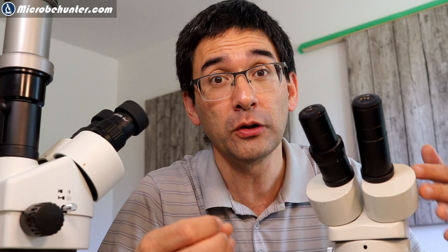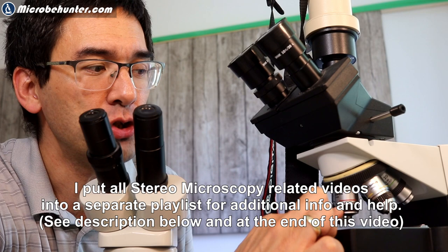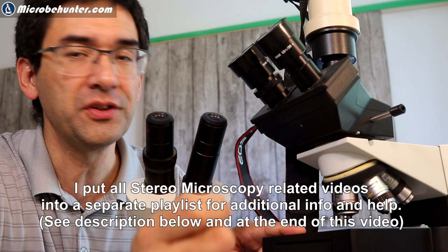The reason stereo microscopes are sometimes confused with binocular compound microscopes is that they too have two eyepieces to look through. But a compound microscope has only one objective. The image picked up is split into two parts, and both eyes receive the same picture — meaning you do not get a stereoscopic image. You also need microscope slides placed on the stage.